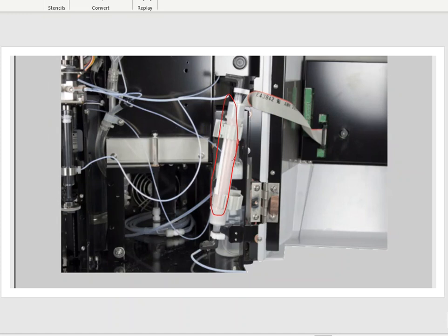All right, so that's all there is to replacing a halogen scrubber. Again, it's not rocket science here. This is something that could be commonly replaced. It's something that I have to have easy access to, and literally the only thing I do is unsnap the top, unsnap the bottom, remove this piece fully, put in my new one, and connect the two tubing lines again.